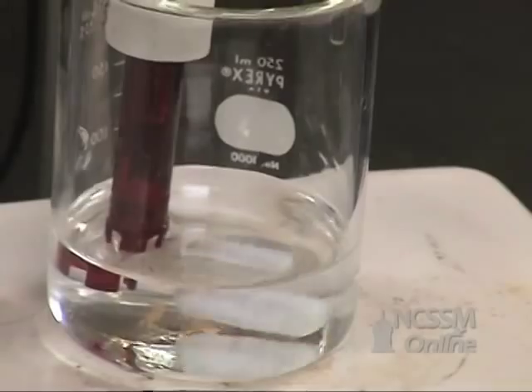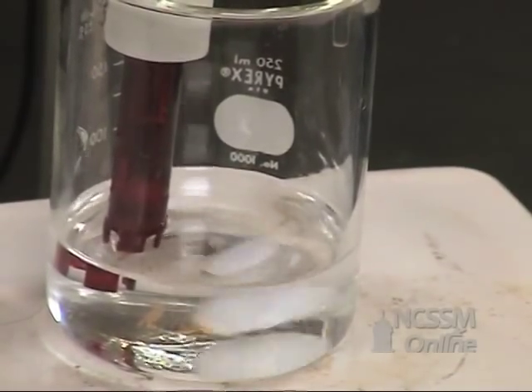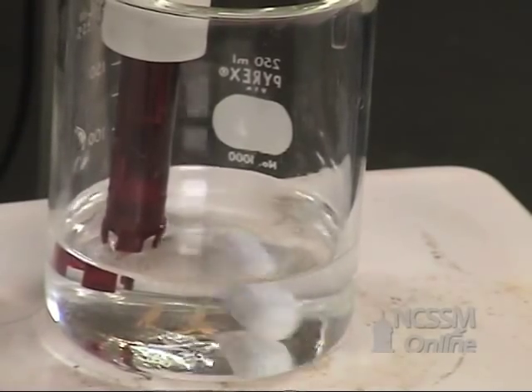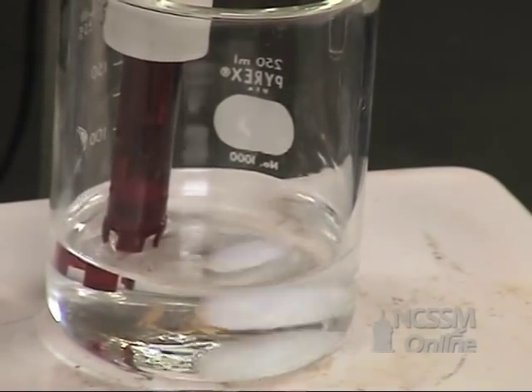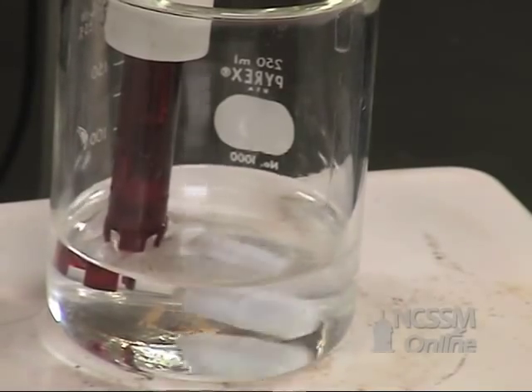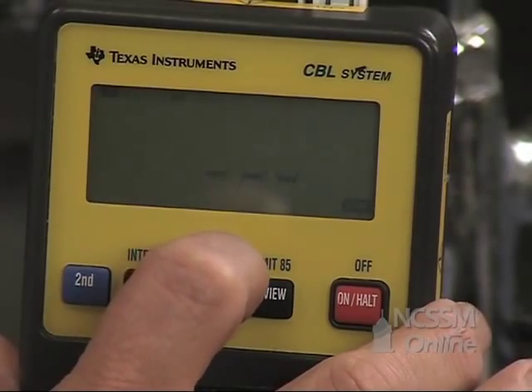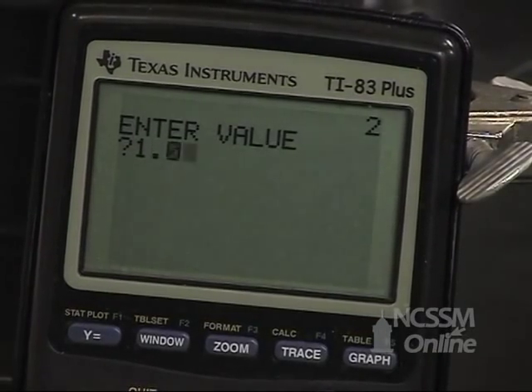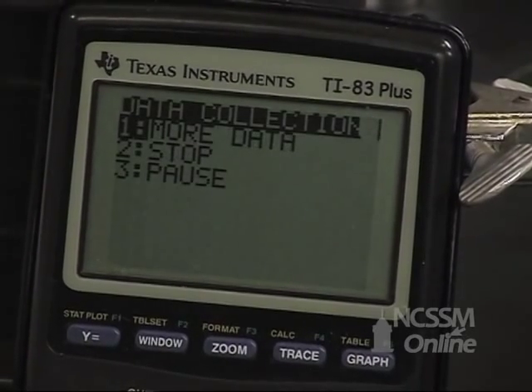We're now going to add as close to 1 milliliter of sodium hydroxide solution as possible. If you don't hit exactly 1 milliliter, simply read the volume and enter that volume into the calculator. When the CBL reading is stable, press trigger and enter the value on your calculator: 1.00 milliliters.